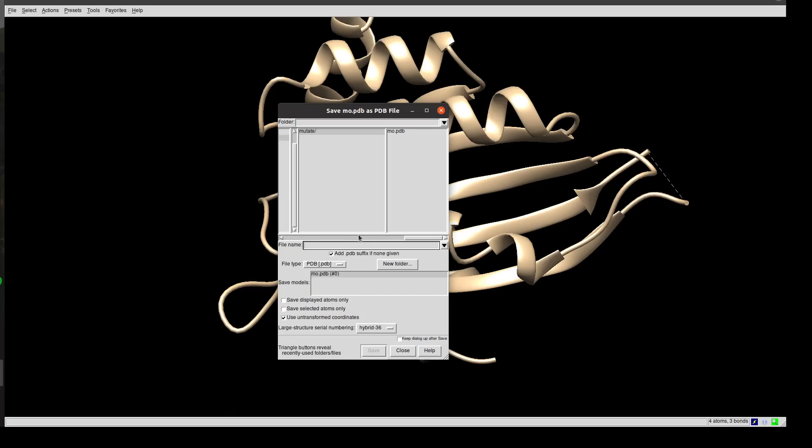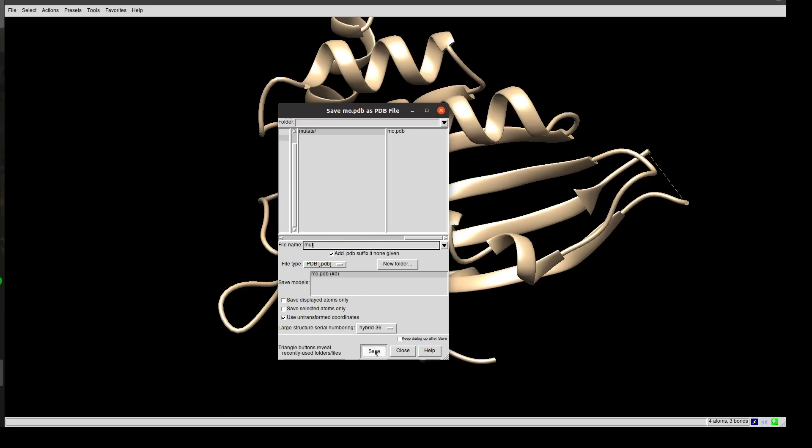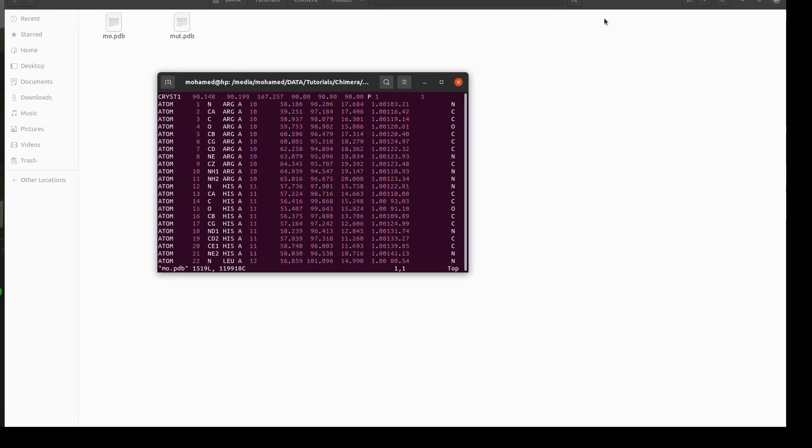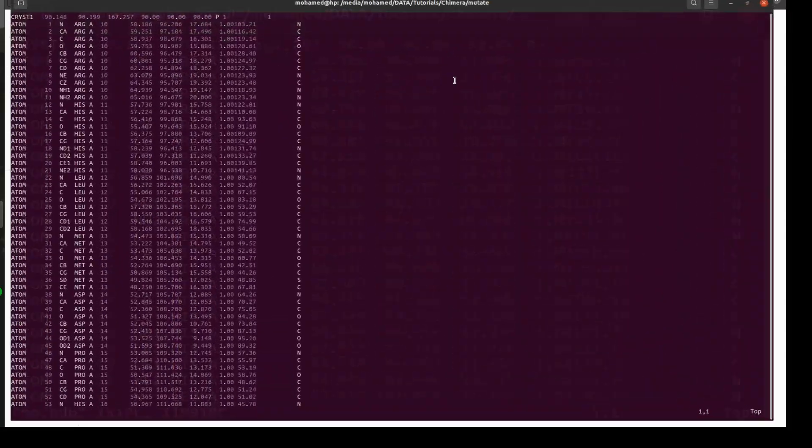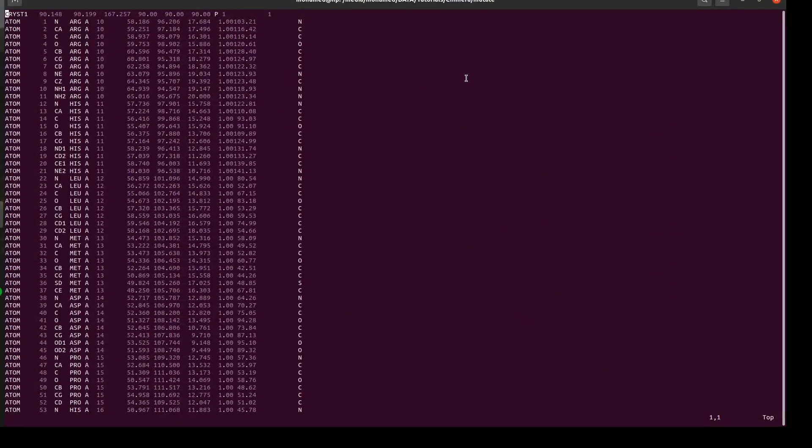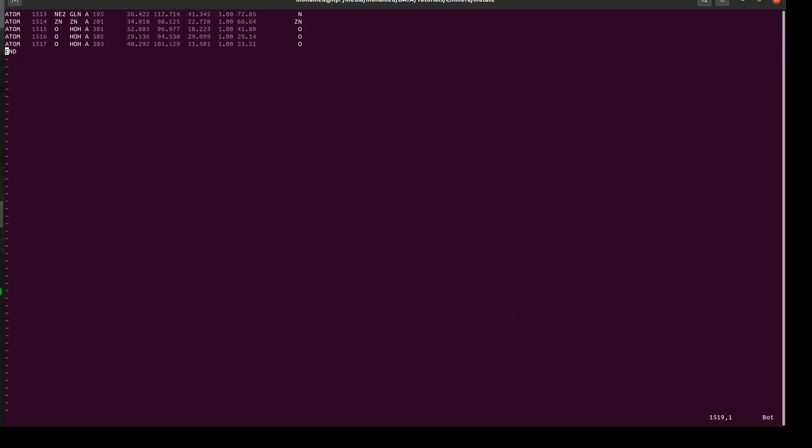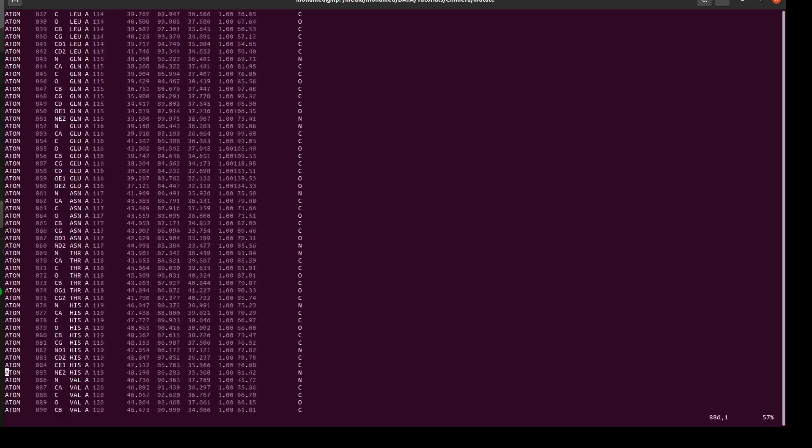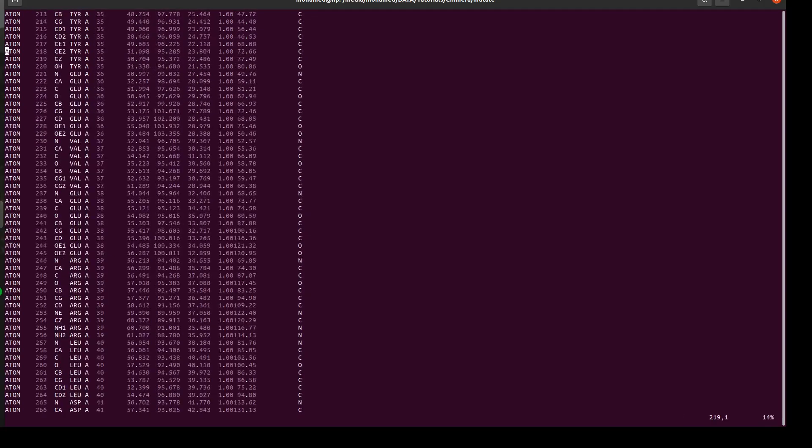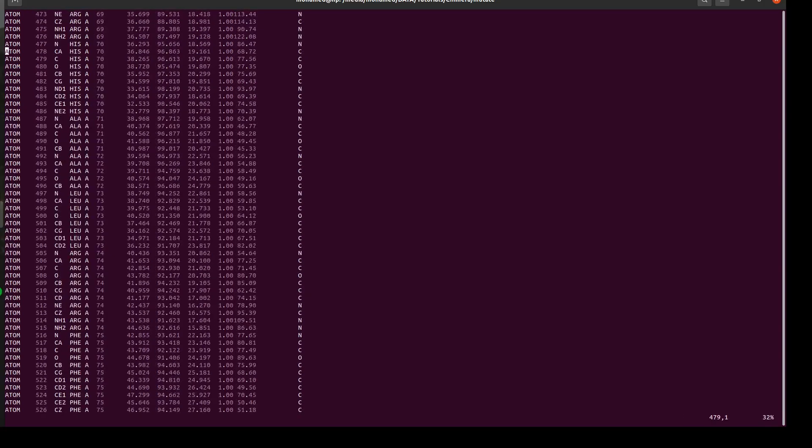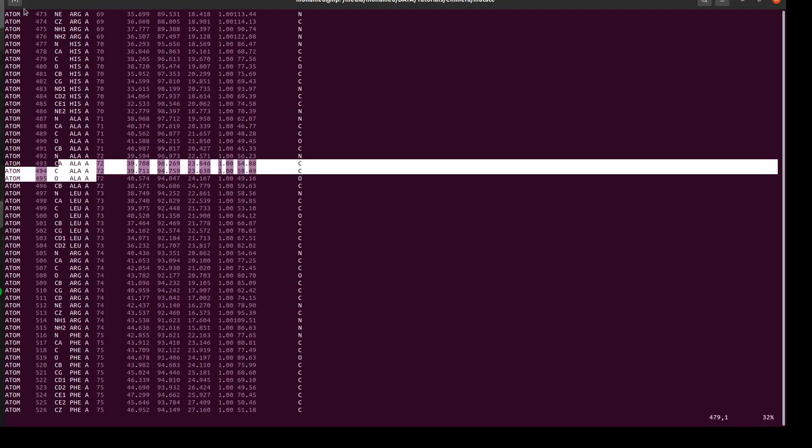I'll show the original file, which was mo.pdb. I'll go down to residue 72. Yeah, it's Ala.